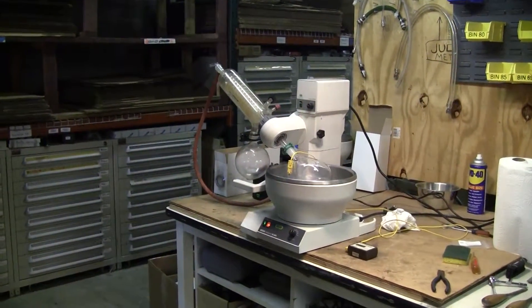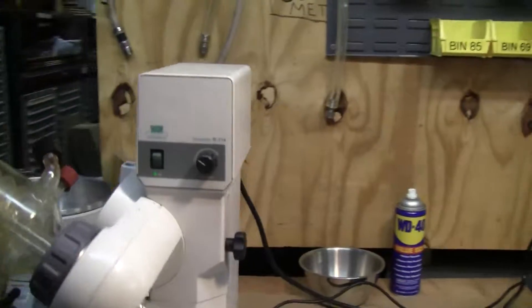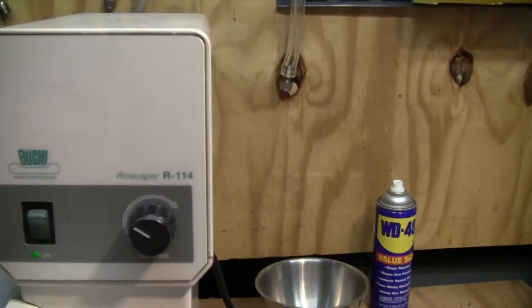Hi, this is Kevin from Hitechtrader. We're looking at the Bucci Rotovap 114.